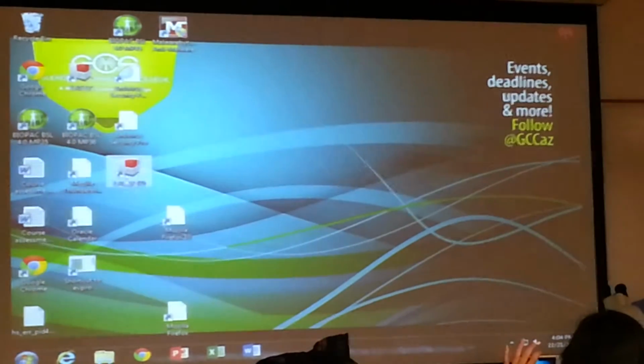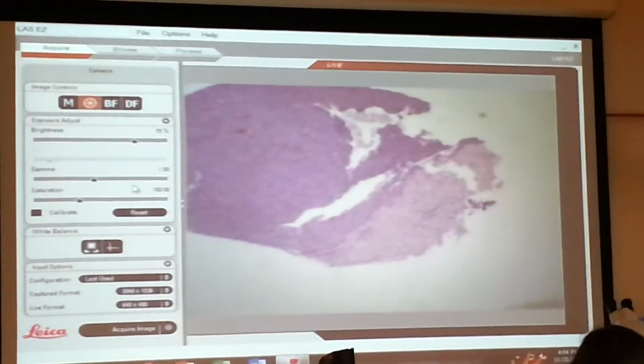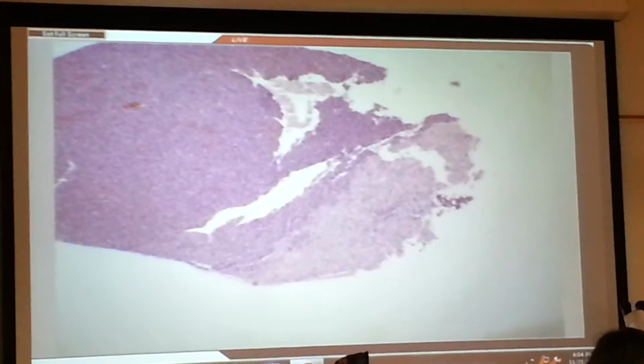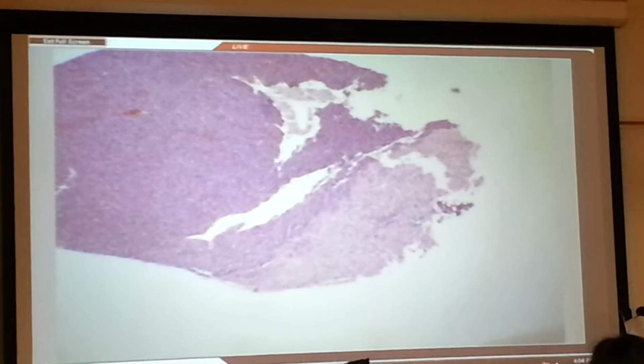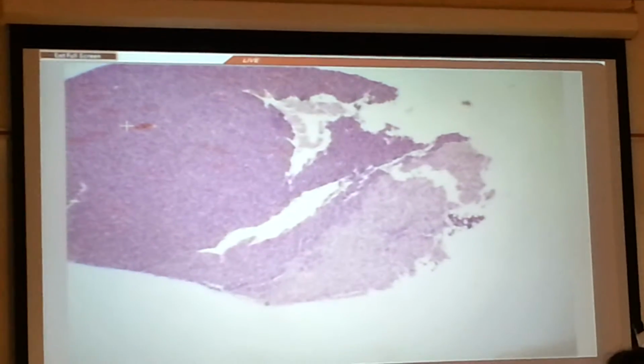Pituitary gland is primarily identified because the anterior and posterior are right next to each other with a pretty clear dividing line between the two. Mine's torn, don't let that throw you. But you see there's this whole light area over here and then this whole dark area. That split, where part of it's light and the other part is darker, tells you you're looking at the pituitary gland.